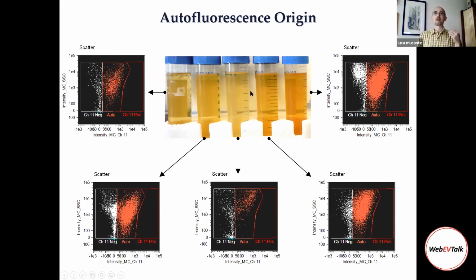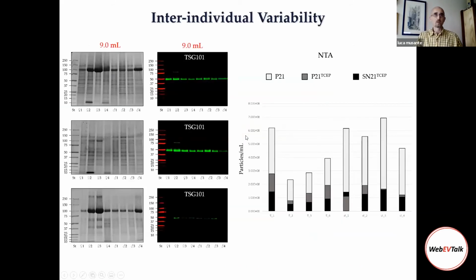What's interesting is that as soon as the urochrome is filtered through the glomerular filtration barrier, it matches with PODXL as a specific marker of the epithelial cells forming the glomerular filtration barrier. Finally, we extended the analysis to different donors, and in this study we enrolled 4 females and 4 males. As you can see, we could get a different amount of EVs in the 20,000 g pellet, depending on the condition of the urine from each donor. This is in line with what I presented so far.